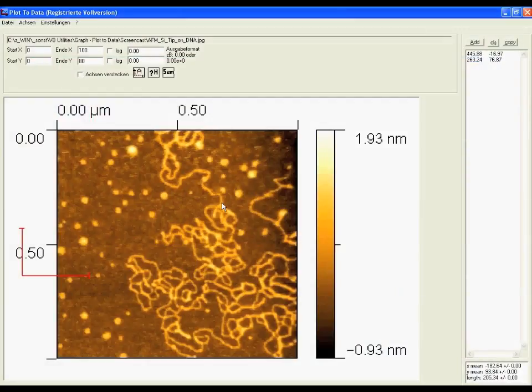Here we have an AFM image with DNA filaments and we want to know how thick are they. For example, we don't have the AFM data because we copied the picture from a paper, from a journal or we scanned it. But we have the scale over here. So this is how we do.